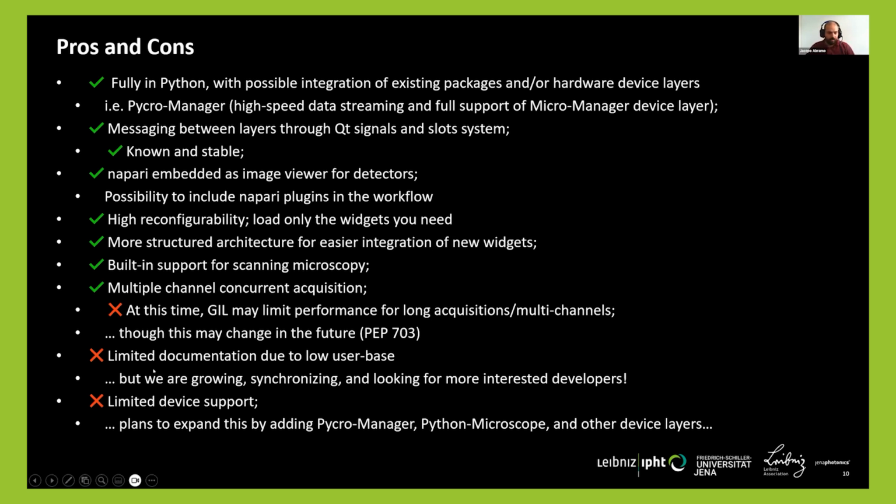in Python. At the moment, we have limited documentation due to a low user base, even though this is growing and we're trying to expand and reach out to other people that may be interested in this solution. And we also have limited device support. But again, this is easily covered by integrating packages that have a strong background, such as, like I said, Micro-Manager or Python Microscope, or possibly other device layers as well.